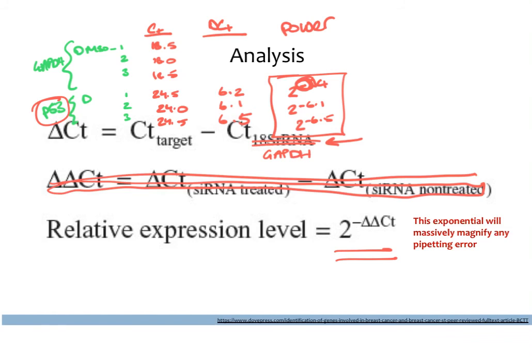Now, if we had a control versus a knockdown that we were specifically interested in, like if I had my TMZ sample here as well, I could have done this double delta calculation. But I personally prefer to just graph all the conditions and show the control on my graph. And if I did this, I would basically eliminate the control and only have my treatment condition. So I am not going to do this. I'm going to keep them separate. So I would have 3 numbers for DMSO and then 3 more for TMZ. And this is what you can put into Prism to graph.